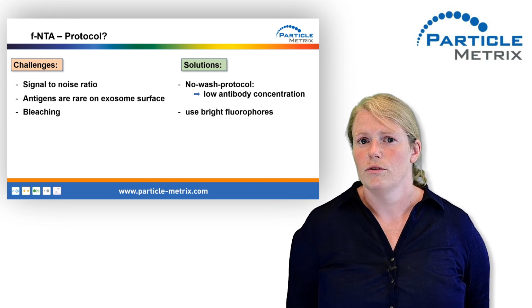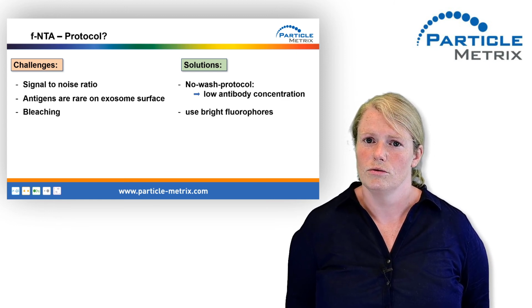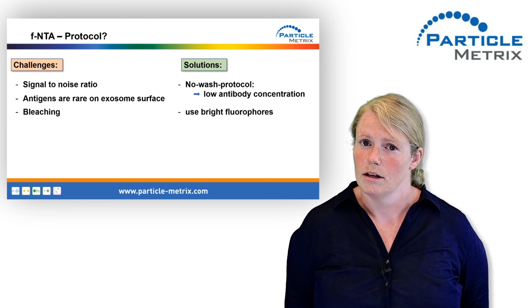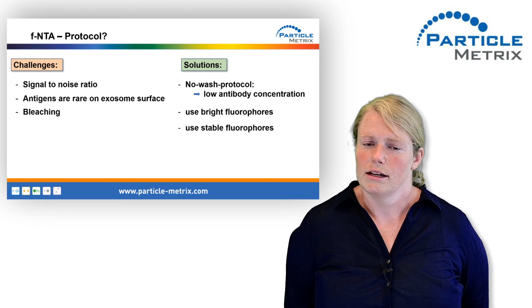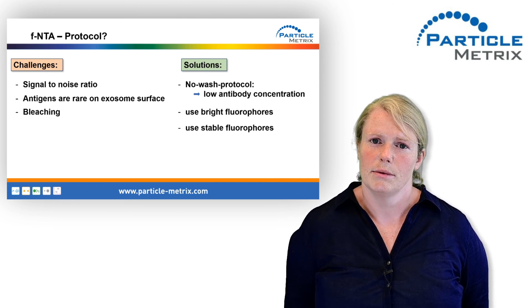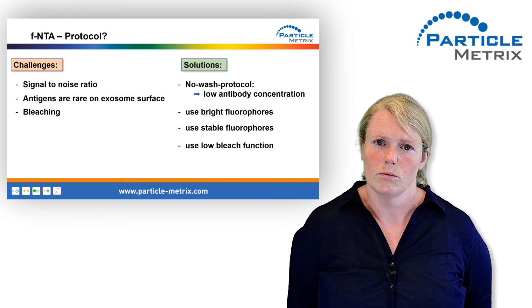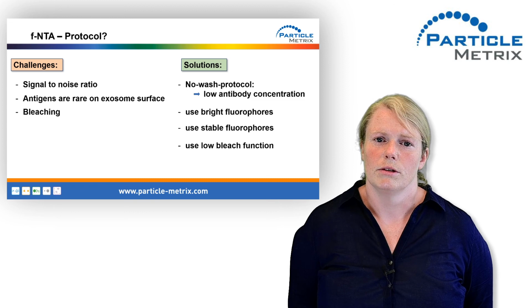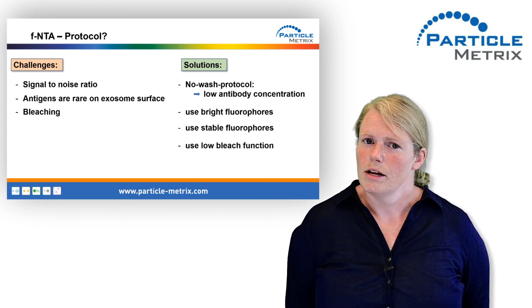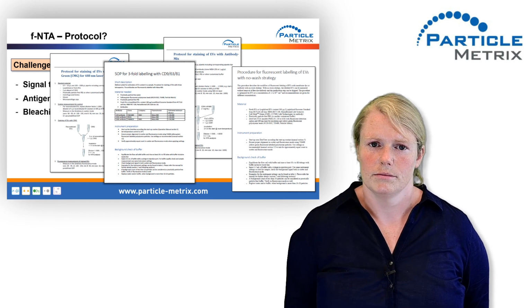Use bright fluorophores, since only a few of them can bind to one exosome due to the limited number of antigens. And use stable fluorophores, since we are tracking our particles to calculate the size. And last but not least, use the low bleach function. In case you are using an old software version without this function, please get in touch. We can update your instrument. We can also help you with protocols, for example, for the triple staining I was talking about.